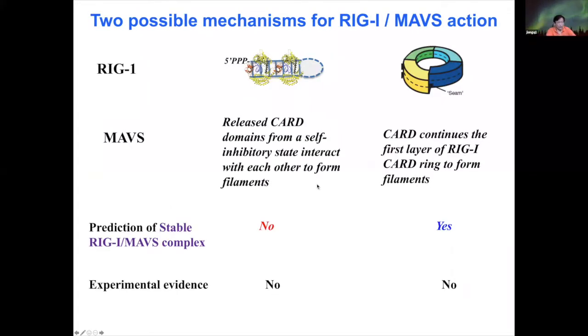So what's the real difference? The real question is which one is really physiological, or whether both are physiological. We still have no firm conclusion yet, but in the literature, there is some data which is based on the C1 symmetry on the right side.